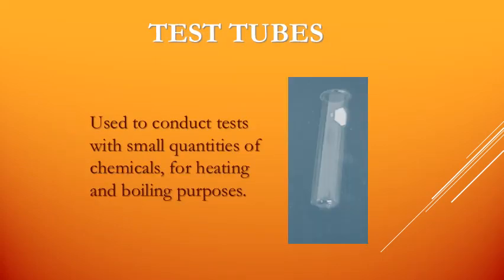The next apparatus is a test tube. It's very common, in every lab you will find it. It's made up of glass, and it's also available made of Pyrex glass.